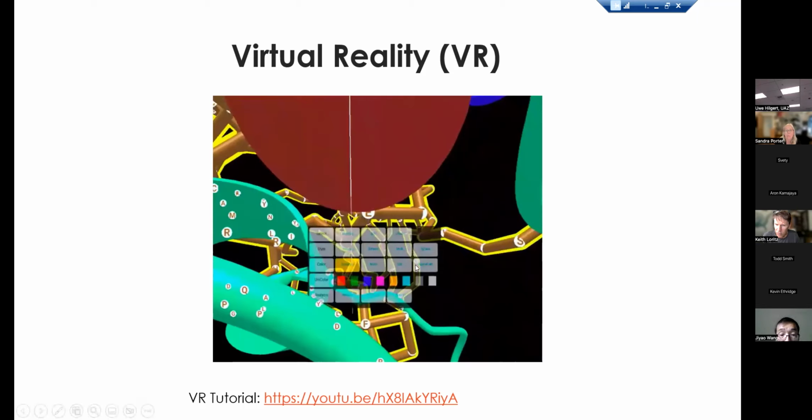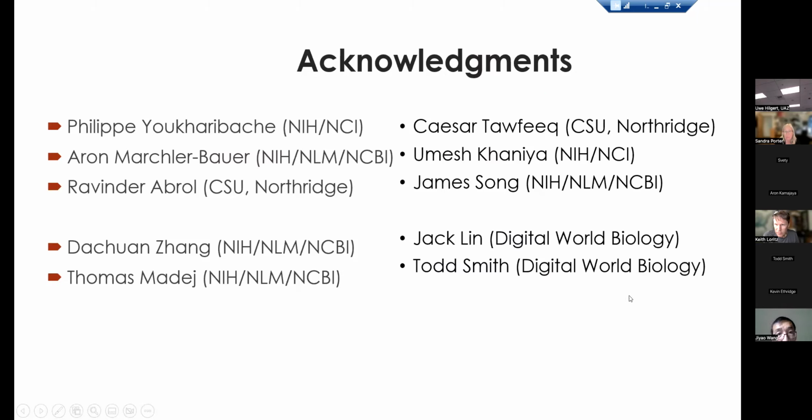And also there are menus in the VR mode. So basically, this will be very interesting to students for teaching purpose. And there's a VR tutorial in this URL. Okay, I think I will stop here and I can answer questions.